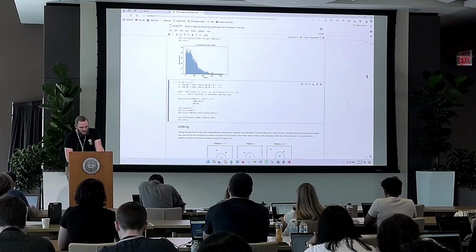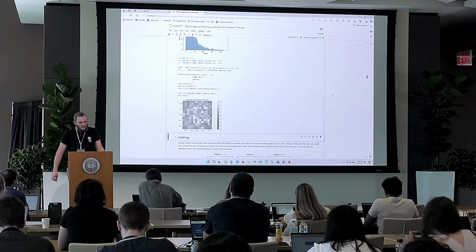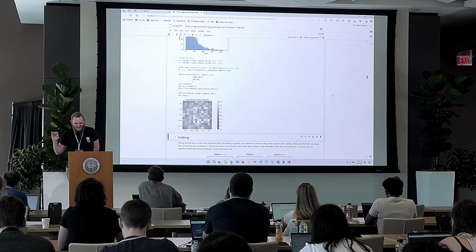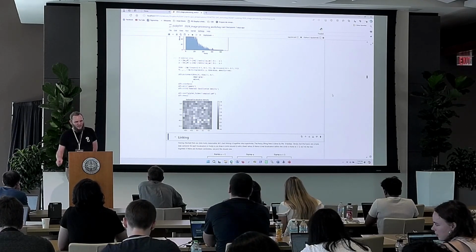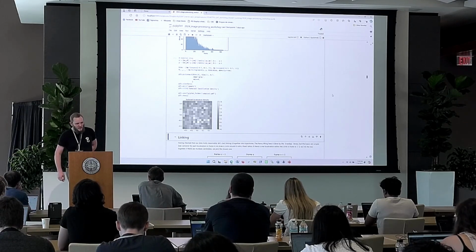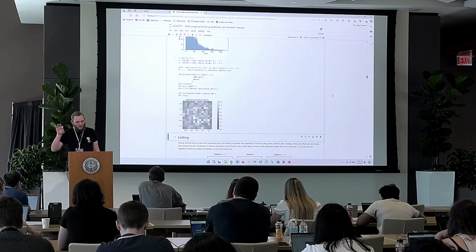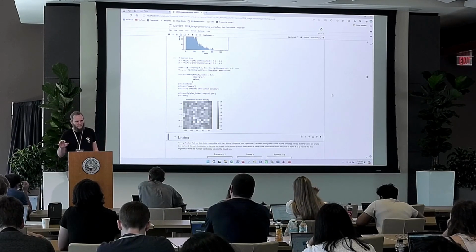The next thing is already a bit more subtle. This is subpixel bias. I don't expect you to remember these numbers, so I will give them to you again. The pixel size in our movie is 128 nanometers. Thunderstorm reports that it can localize our fluorescent spots with an accuracy of 10 nanometers. That's an order of magnitude difference. So we better make sure that in reporting these very accurate localizations, Thunderstorm didn't get confused by the pixel grid that's overlaid, but interpolated everything correctly.